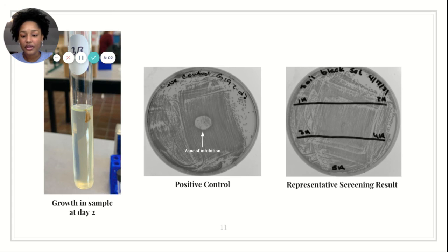A variety of issues could have also stemmed from the methodology used, and it may have resulted in the experiment not being efficient enough to allow the bacteria present to secrete enough or any antimicrobial natural products at all. The bacteria in the samples also may have been able to sense a difference in their environment, and their response may have been to cease the production of natural products. Lastly, the time from the collection of the soil samples to the time of the analysis of the aliquots may have been too long for the bacteria to survive due to temperature differences or other external factors such as light exposure or humidity. In the future, it may be feasible to shorten the time between sample collection and analysis. It also may be beneficial to test aliquots against multiple types of bacteria instead of just one.